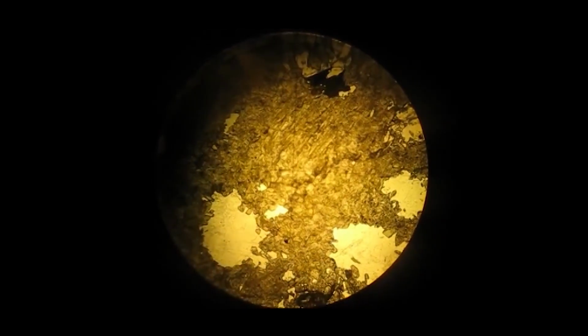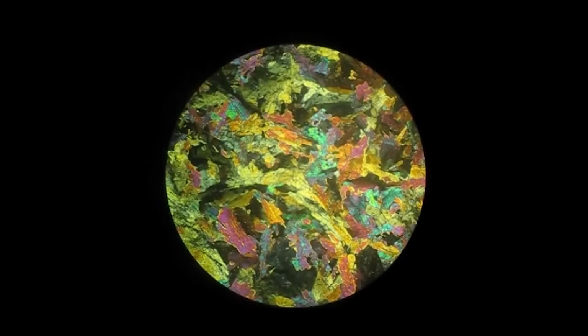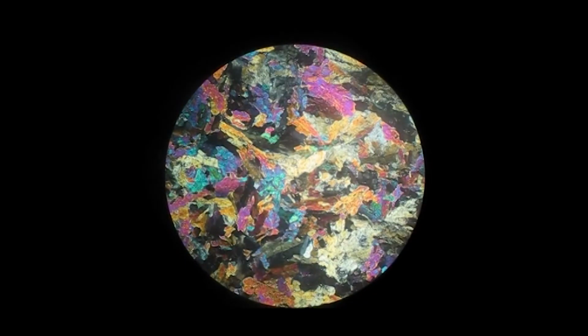In anisotropic minerals, the index of refraction differs with direction. A mineral fragment showing high relief in one direction and low relief in another is said to have variable relief. Such a mineral shows this on rapid rotation of the microscope stage under plain polarized light without using the analyzer. There is a variation in relief, with alternation of strongly marked and slightly marked borders giving a twinkling effect, and hence this phenomenon is called twinkling. Calcite is a very good example of a mineral showing twinkling.